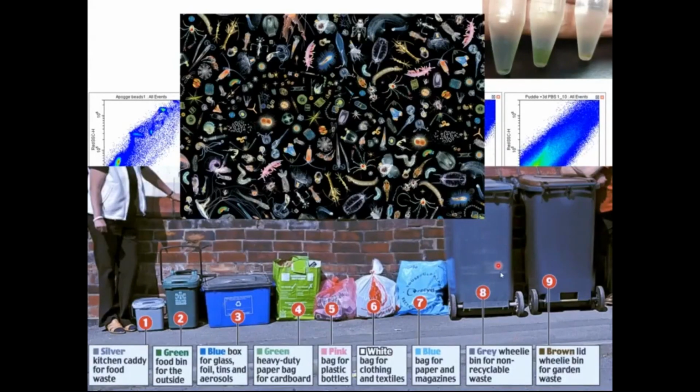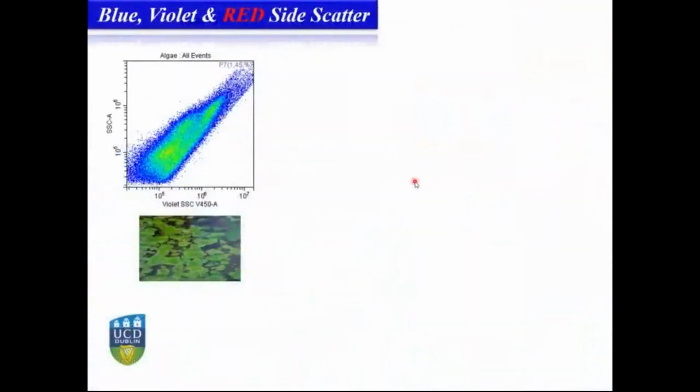If you remember, we were talking about the garbage. These compositions, these cargo and content, they have different sizes, but also the structure of the membrane could be different, and the content that they have could be completely different. So can we use this scatter in our favor to characterize my EV populations? Because once we see them, we can separate them, we can sort them, and analyze afterwards the proteins and mRNA, so even further characterize this. So let's see what we can see at the moment.